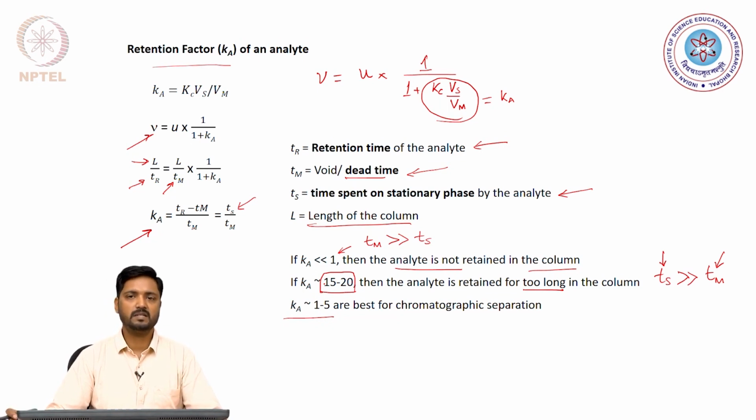This is detrimental not only to the chromatographic separation that we may want to achieve, but can also result in the degradation of the analyte, because the analyte can start reacting within the column. The silica that is typically used in our chromatography columns is considered to be slightly acidic.